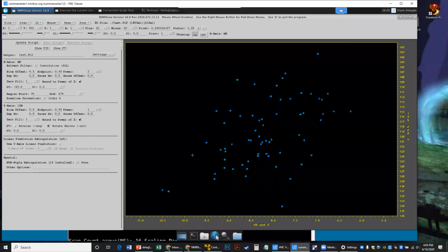Now, this spectrum is already super beautiful and narrow, but just for demonstration purposes, let's do a few interesting things. So for example, question. Yes, Wes Pavlovsky has a question. Can autophase be accessed from the command line? Yes, it can. So let's look at that briefly.